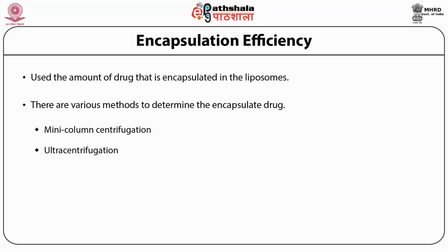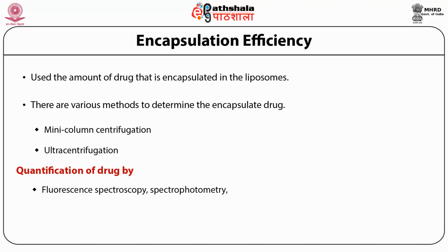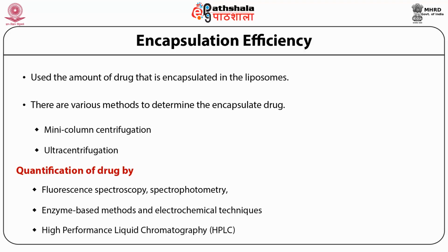This is done by disrupting the lipidic bilayer using methanol or Triton X100. Disruption of liposome causes the complete release of the encapsulated material. Quantification of the encapsulated material can be done by any suitable technique, including fluorescence spectroscopy, spectrophotometry, enzyme-based methods, and electrochemical techniques. High-performance liquid chromatography, that is HPLC, can also be used for determining the encapsulation efficiency, since HPLC is also used to separate the unencapsulated drug from the drug-loaded liposomes. This method can also be used to track the stability of liposomes in terms of leakage during storage.